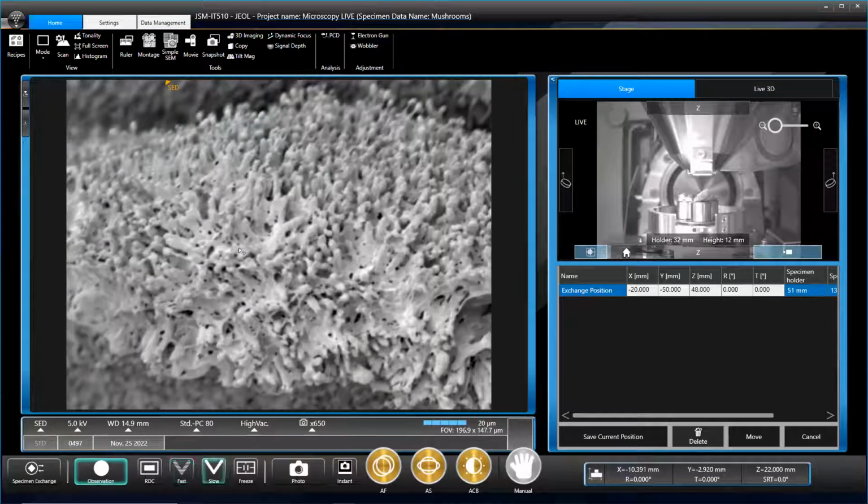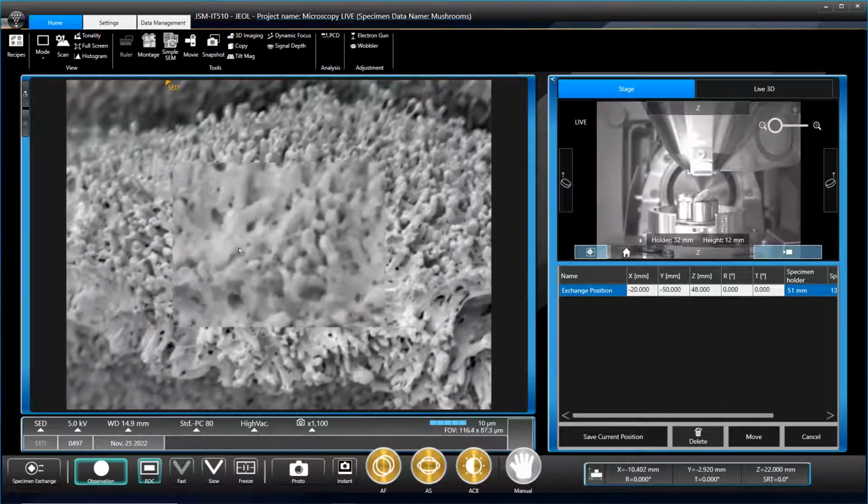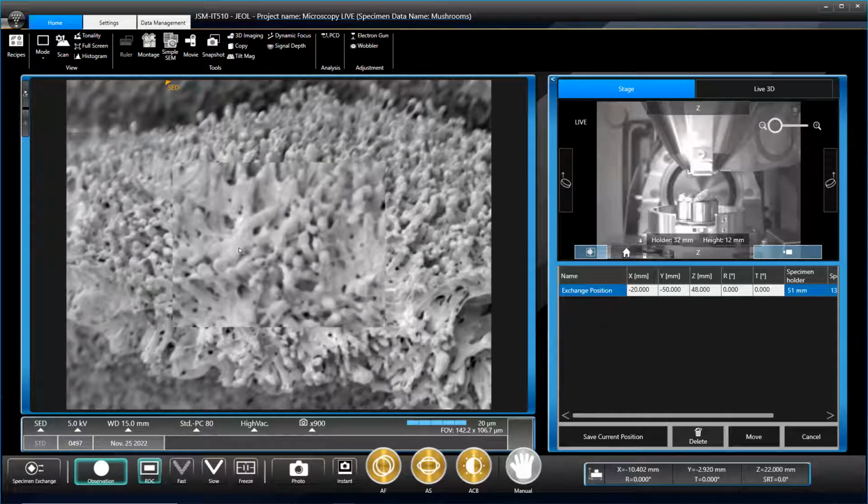Wasn't expecting it to look so blobby. Yeah, so any circular blobs you'll see will probably be the spores. I'm going to give myself 20 minutes before I give up and get Cesca to focus things. I'm really good at flat things, but give me something with texture.